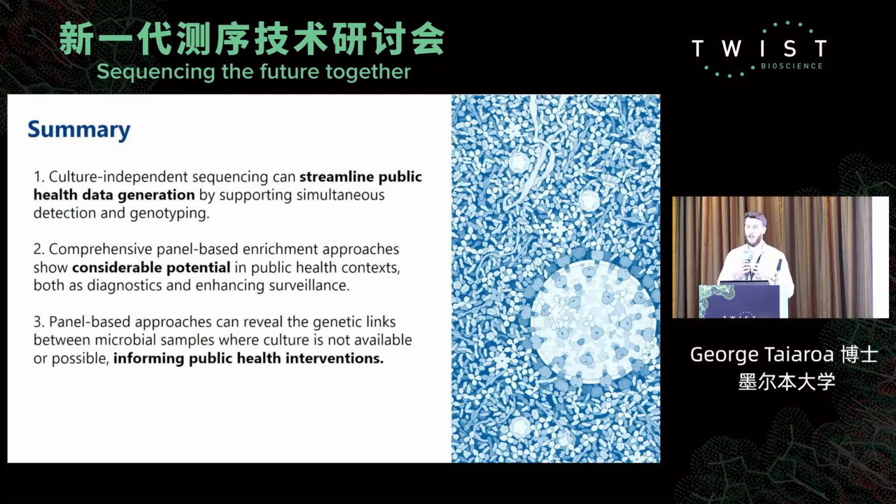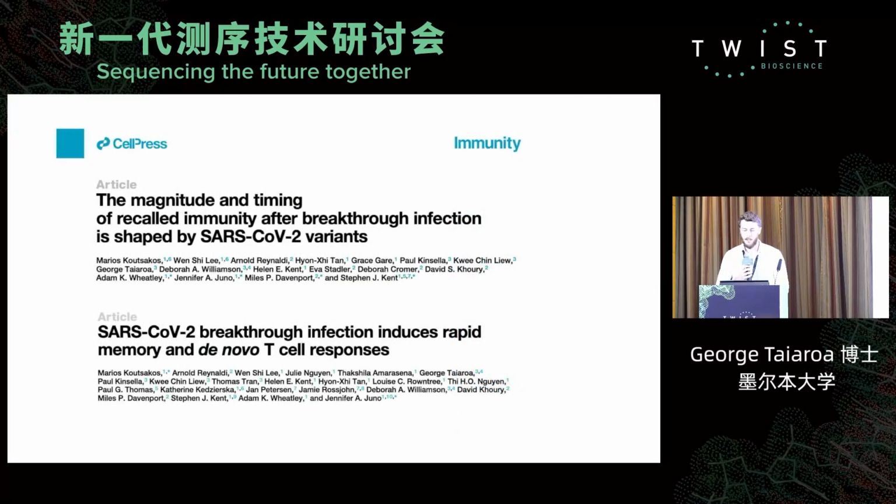So we're able to have relationships with our Department of Health, our kind of government, to say this is an outbreak or this isn't an outbreak and this is how you should respond to it accordingly. So really useful from their point of view. And the last slide I'd like to touch on is that this is all very what I would call the pointy end of public health, where we're interacting with the Department of Health or a government body. But these culture-independent methods are also really useful in the context of fundamental research as well that could inform public health down the line.